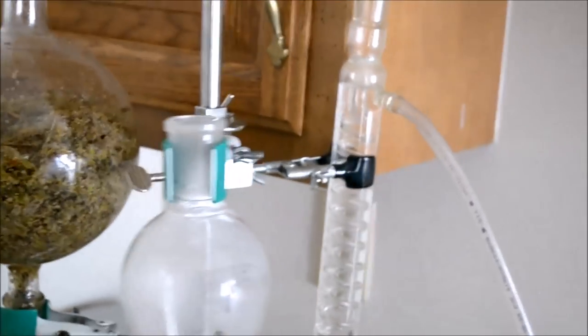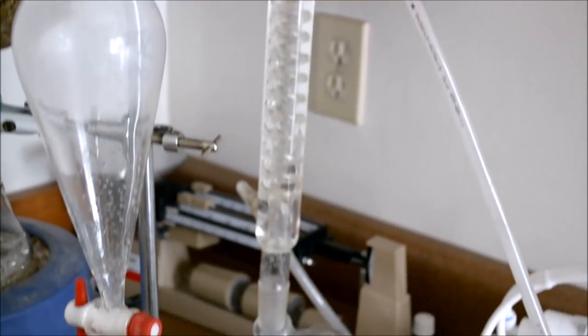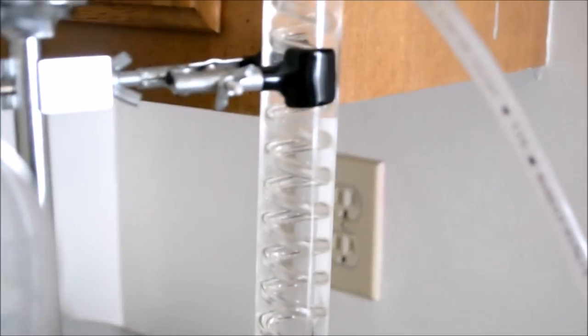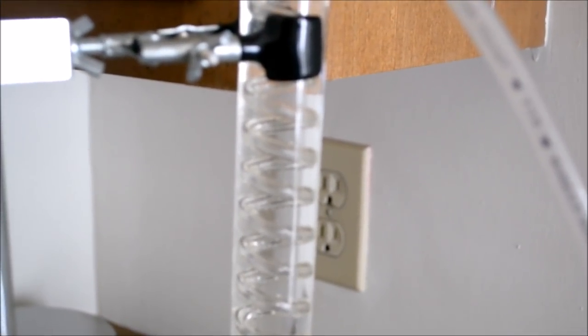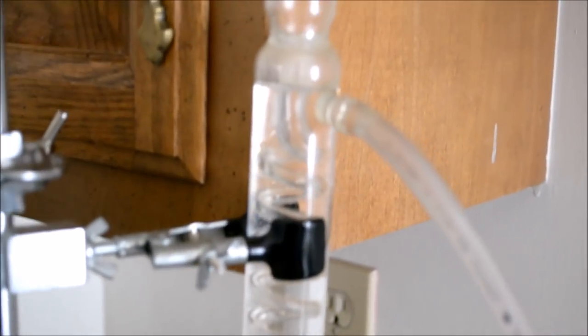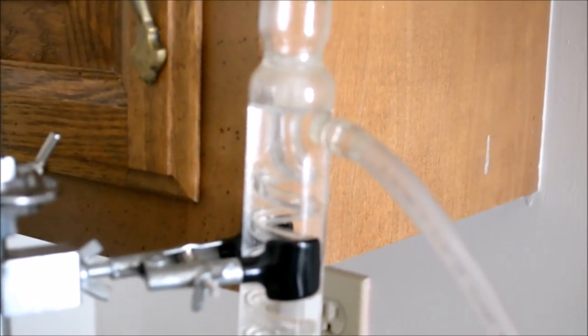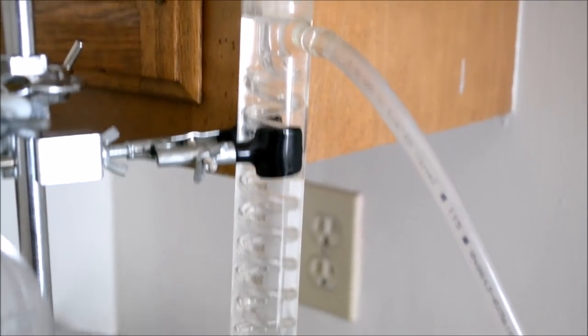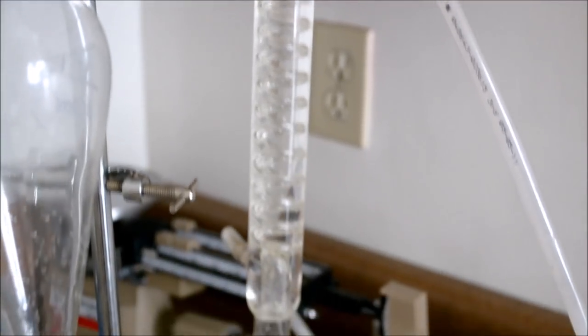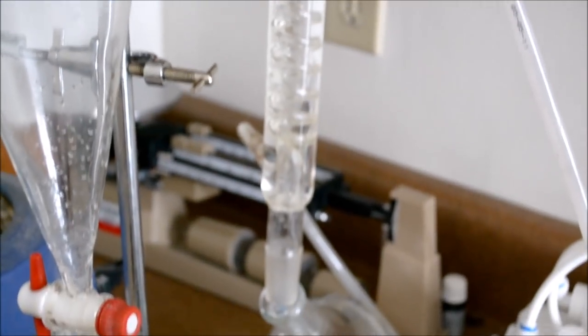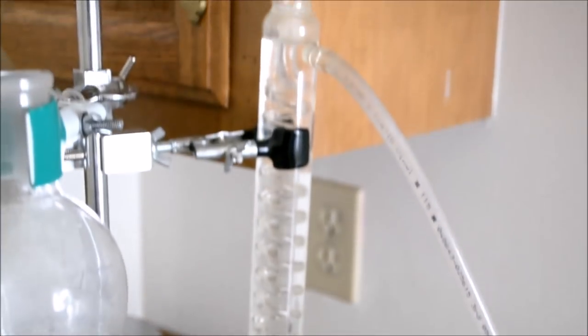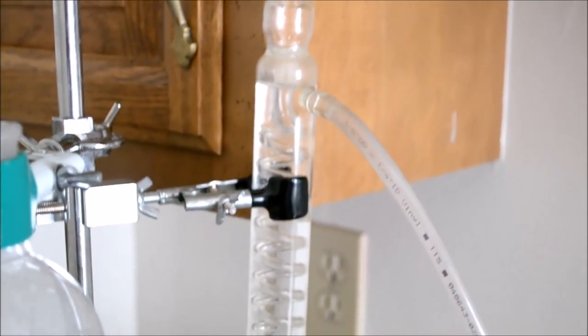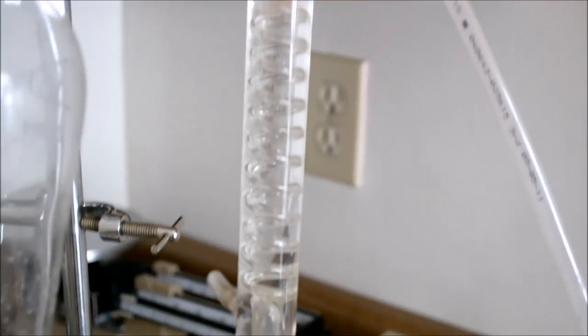The condenser is this long tube that you see here. It has coils inside of it, and the steam is pushed through those coils while I simultaneously push cold water around the outside of the coil. And this is what condenses the steam back into the liquid and allows me to collect it as an essential oil.